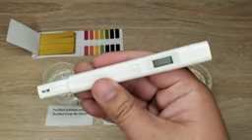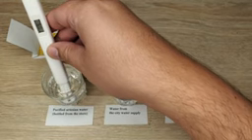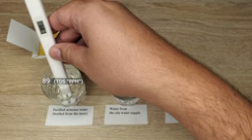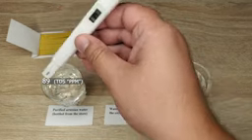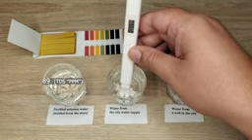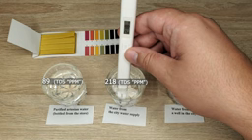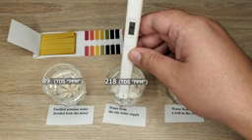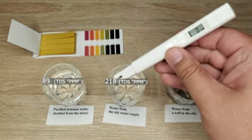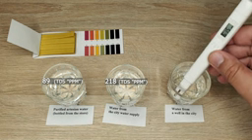We'll run a test. 1. Purified artesian water, bottled from the store. 2. Water from the city water supply. 3. Water from a well in the city.